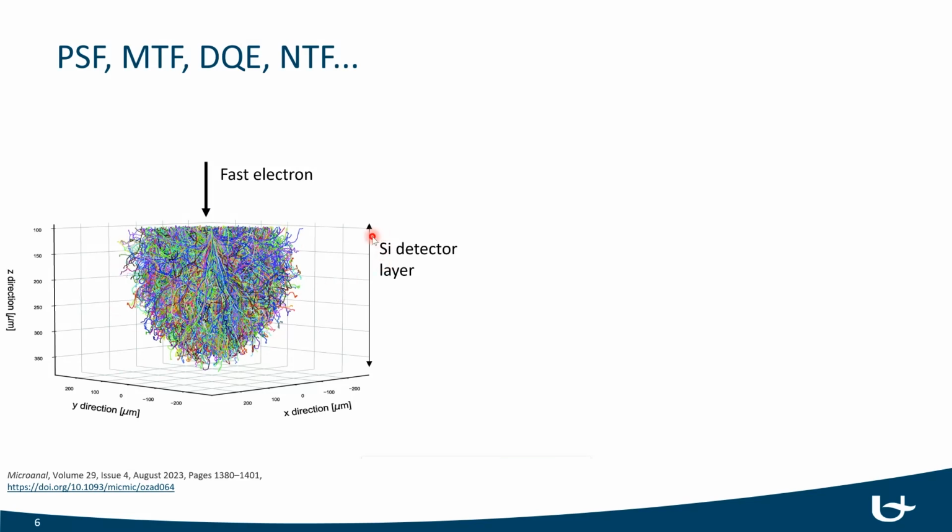So it will depend on the silicon detector layer thickness or the scintillator thickness. And this means that sometimes when a fast electron hits in one point, it will also trigger the neighboring pixels, and this creates a kind of point spread function. So what was once a sharp image, let's say all electrons hit exactly this one point, will look like a broader distribution. And that distribution is the point spread function. It's basically the response to a point-like input, seeing what the output is on the camera.